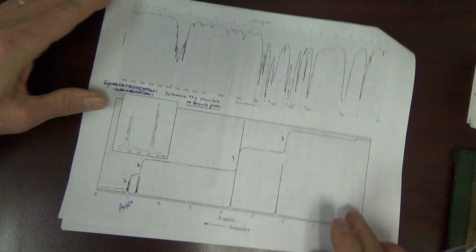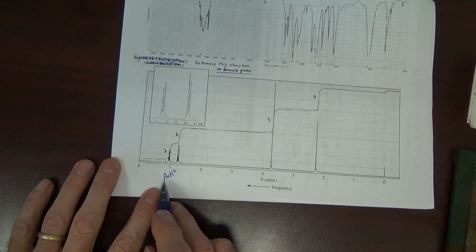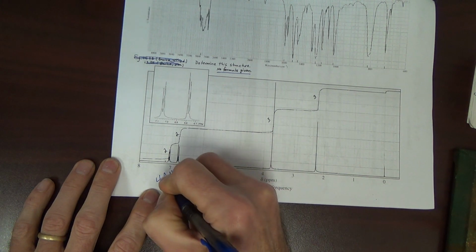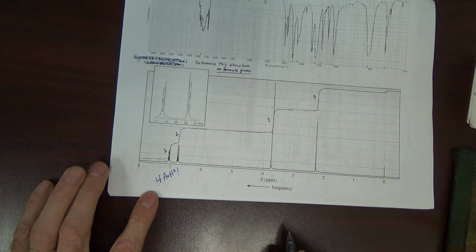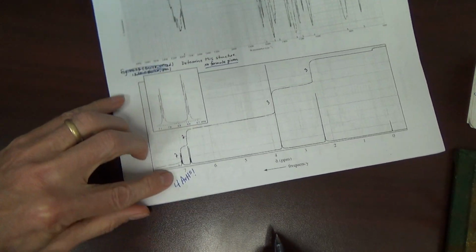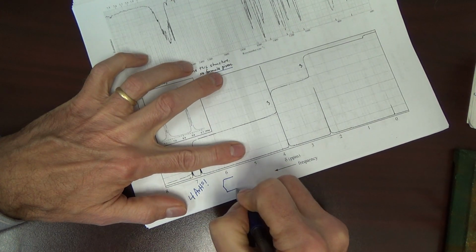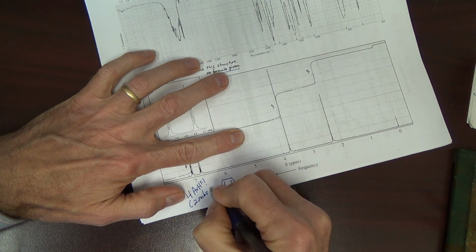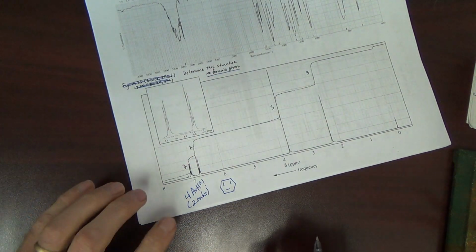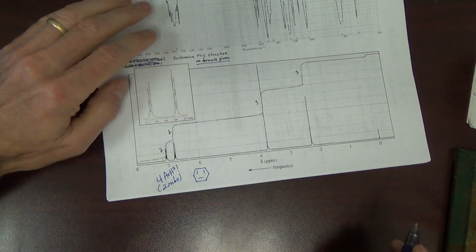All right. But how many aromatic hydrogens in this compound? 4. That means how many substituents on the benzene ring? Assuming it's benzene, assuming it's horses and not zebras. 2 substituents. Now, once we get 2 substituents, we have potential for isomers.